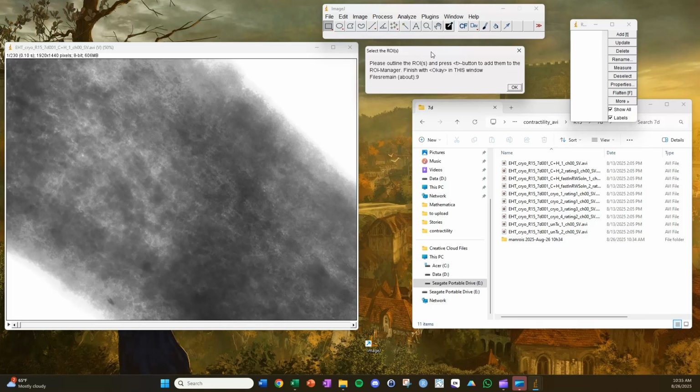If you're doing this for cells, you'd probably want to do the other options that MYOCYTER has that would not involve you needing to manually draw a region of interest. But I think for tissues, this makes sense, and I think it particularly makes sense because depending on how the region of interest gets either automatically or in this case manually drawn, the analysis can change substantially. So this step is very important.